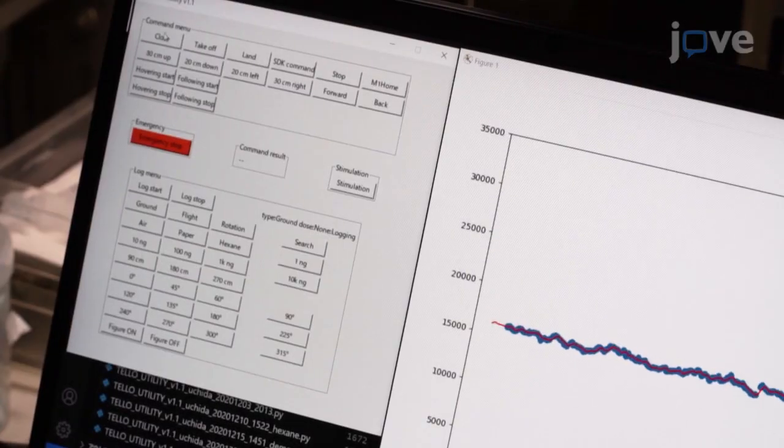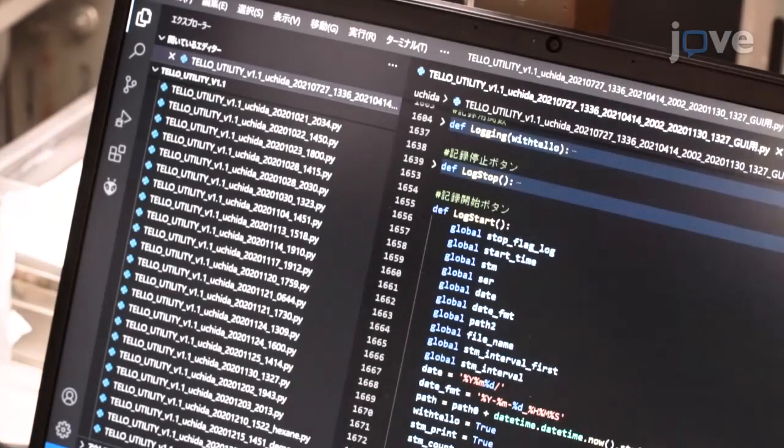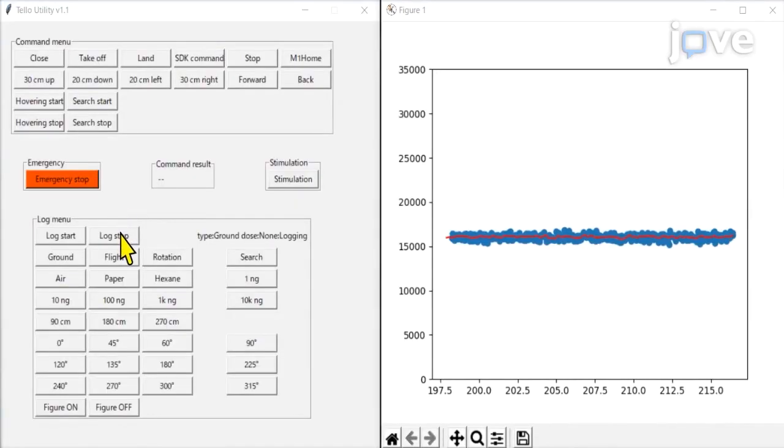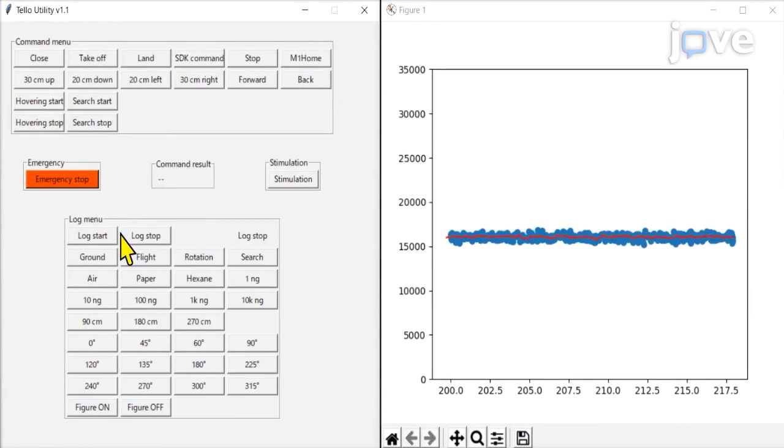Five seconds after pressing the log start button, initiate odor stimulations. Press the log stop button on the graphical user interface or GUI to stop recording.